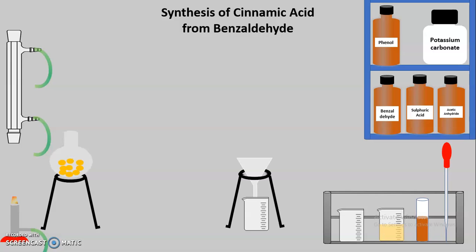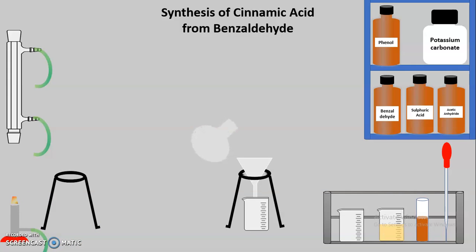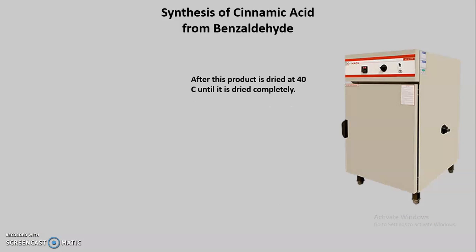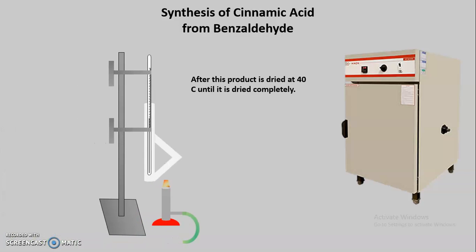Once we have the product, the next step is recrystallization. The assembly for recrystallization uses hot water as solvent. We add hot water to the product and heat the solution until the product dissolves. While the solution is hot, we carry out filtration, and after cooling we obtain crystals of cinnamic acid. After recrystallization, the next step is determination of the melting point after drying. Using an oven at 40°C we dry the product, then use a thiele tube to determine the melting point of the cinnamic acid.